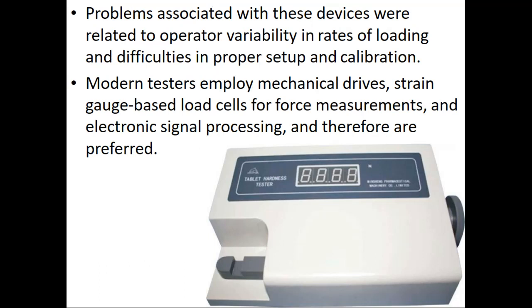Problems associated with these devices were related to operator variability in rates of loading and difficulties in proper setup and calibration. Modern testers employ mechanical drives, strain gauge-based load cells for force measurements, and electronic signal processing, and therefore they are preferred. The device in the picture here is the one used in our laboratory.